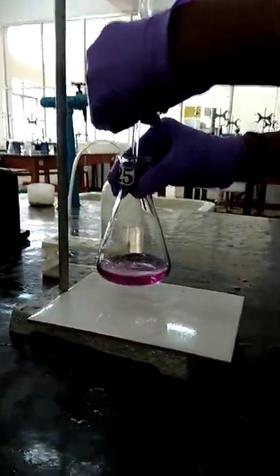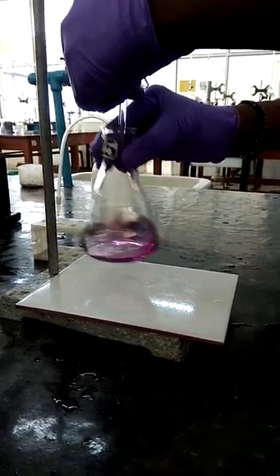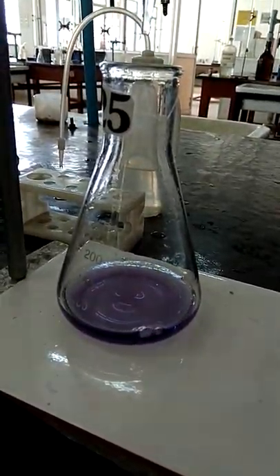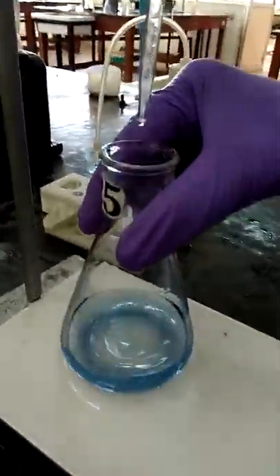Near the end point, we are getting some blue color. You have to add drop by drop. We are very near. You should add drop by drop. This is just before the end point. Okay, you add one drop. See, it becomes blue. This is the end point.